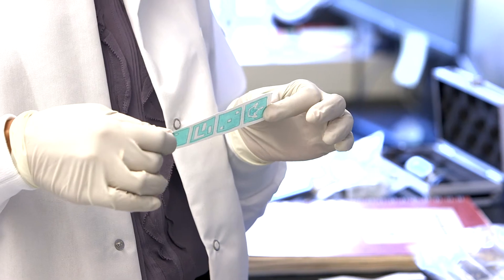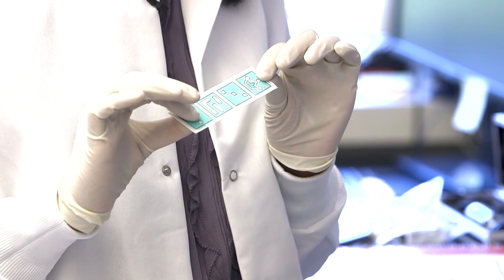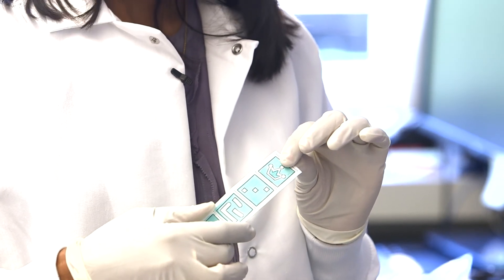The way the microfluidics works is that we make channels for the fluid flow by taking a piece of paper, which is water-loving or hydrophilic, and making parts of it water-repellent or hydrophobic.